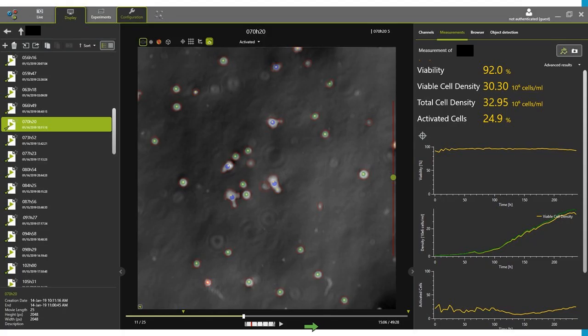That is all in the background. What is it you see, what you get in the lab? In the lab, you see, of course, in the software, your cells, the images of your cells. So that's the big image in the middle. On the left side, you see all the individual data points during one run.